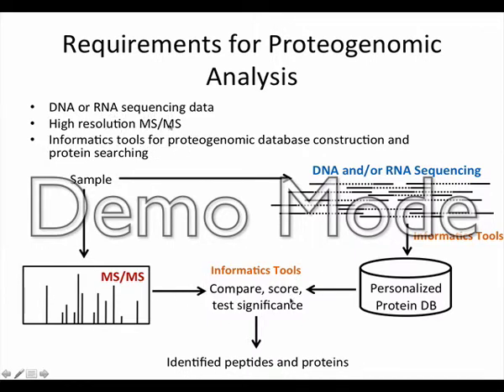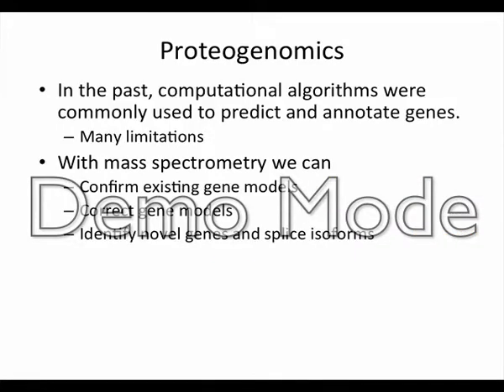And this also uses informatics tools such as X!Tandem. I think you've probably heard a lot about these. These are the same tools that we would use here. You would just use a protein database that's different and not the reference. And that's really the primary thing here. We're going to go into a lot of detail about that.